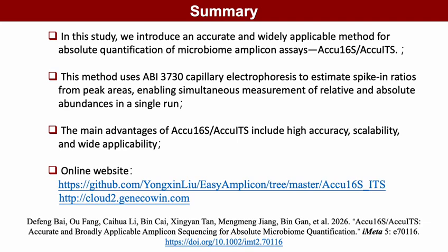Its analysis code is freely available on GitHub, along with an online platform for streamlined data management and absolute quantification analysis.